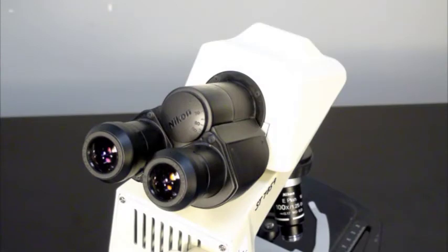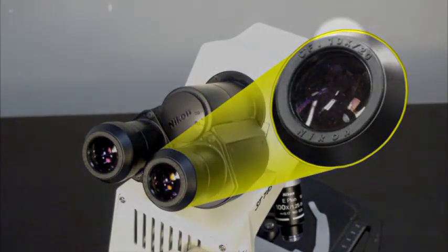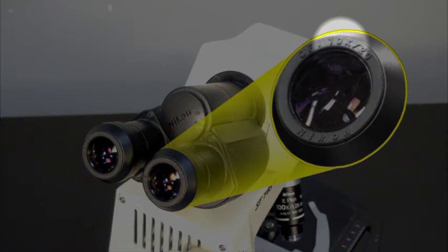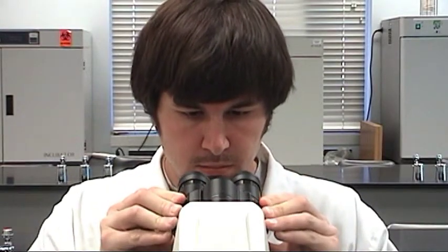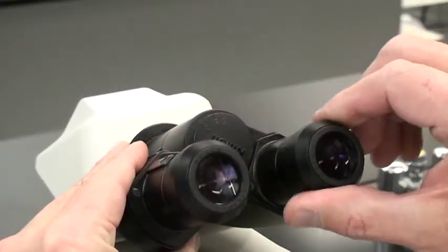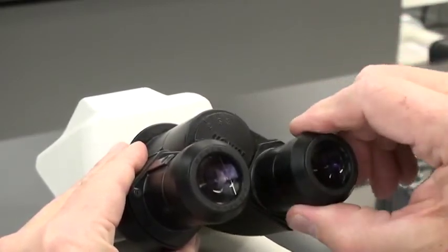The oculars increase image magnification by 10 times or 10x as indicated by the markings. They can be swiveled to match the interpupillary distance between your eyes and adjusted to compensate for differences in individual vision.